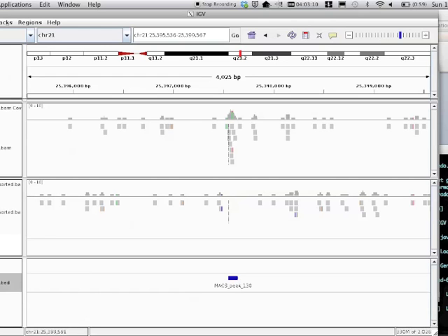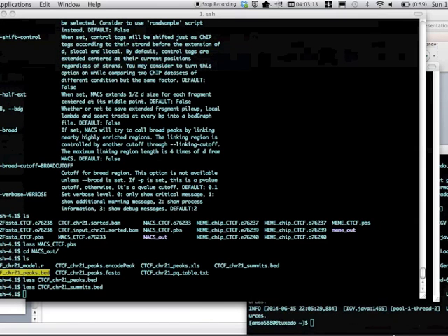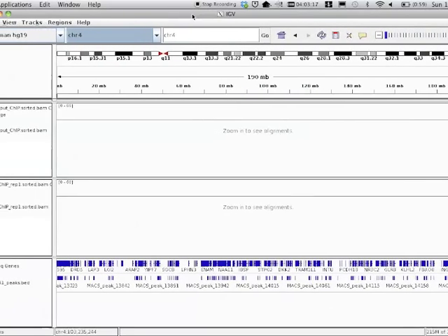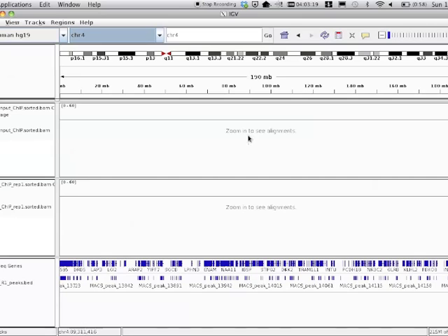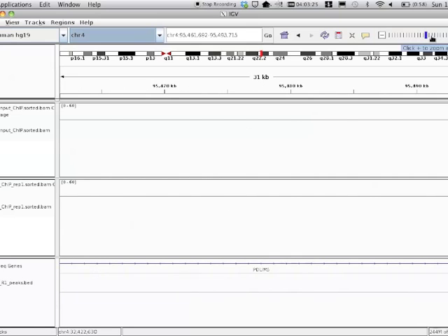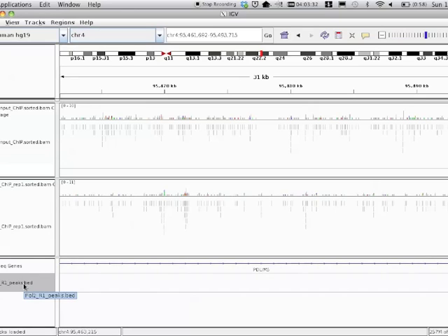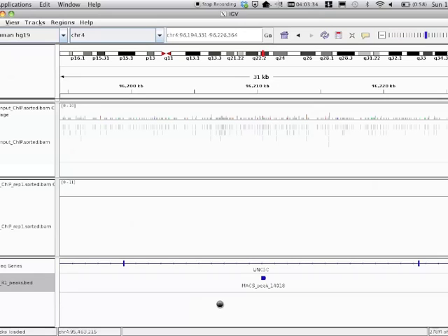So I mentioned that broad setting before, and I just want to show what some IGV data looks like from that broad setting. Here, I'm looking at Pol II, which should have peaks and be broad. I zoom in so that I can see peaks, click on this Pol II track, and do Control F, and it brings me to somewhere it has a peak annotated.